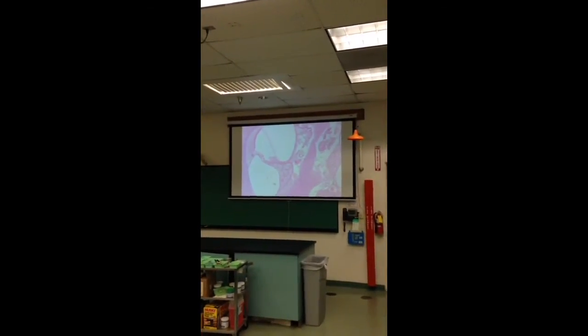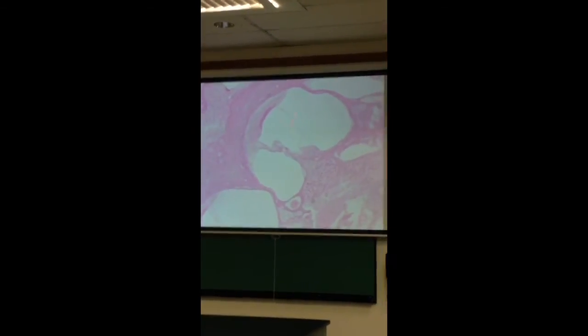Out of simple squamous epithelial tissue, right? So you can see that right there's the thinnest structure on this slide. You can see them pretty easily as we go between these slides. What slide is this? Cochlear units here. If you go to this one up here, cochlear, can you see it pretty easily going on over there? And it tells you pretty quickly what you're looking at, the direction things are going to be arranged, and whatnot.